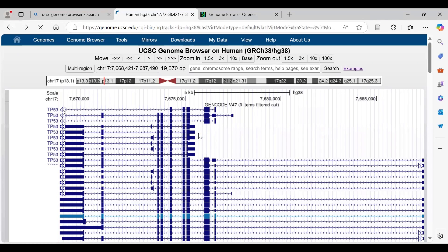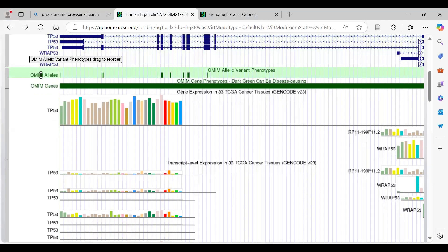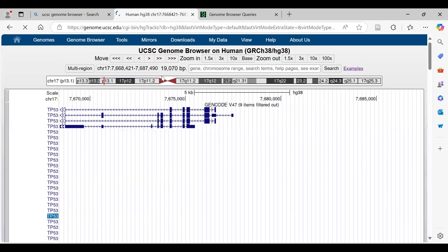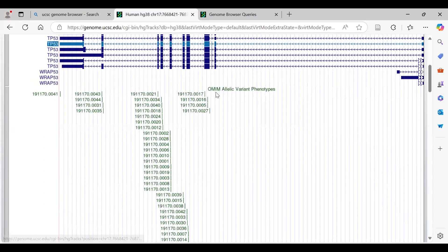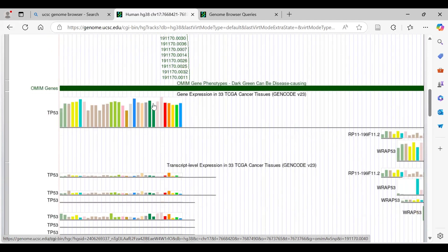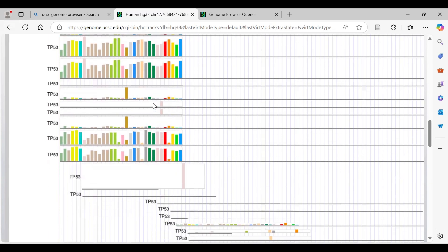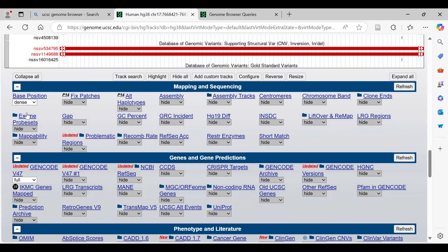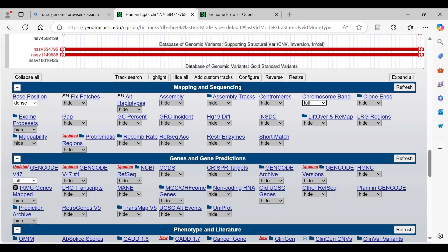One feature here is that you can access the DNA sequence. Scrolling down, we have OMIM alleles associated with the gene. Clicking on it displays OMIM allelic variant phenotypes — for example, non-Hodgkin lymphoma and Li-Fraumeni syndrome. In the Mapping and Sequencing section, you can enable chromosome band visualization by selecting full, and it will appear in your representation.